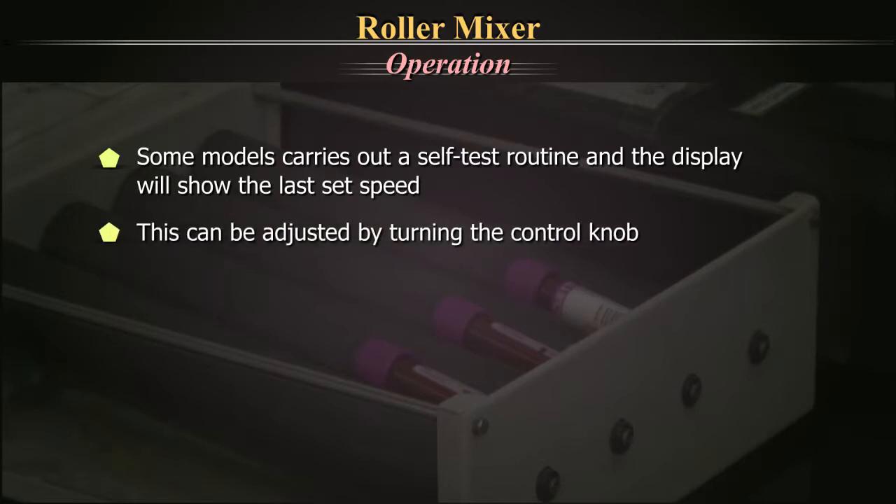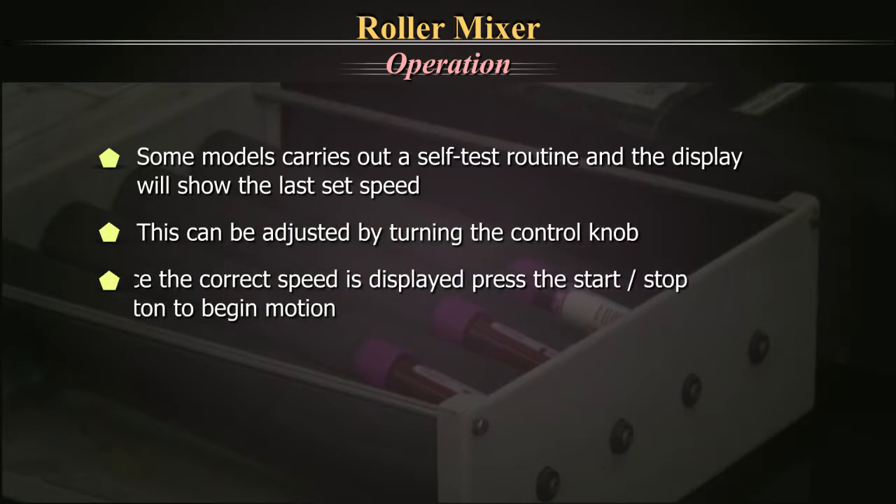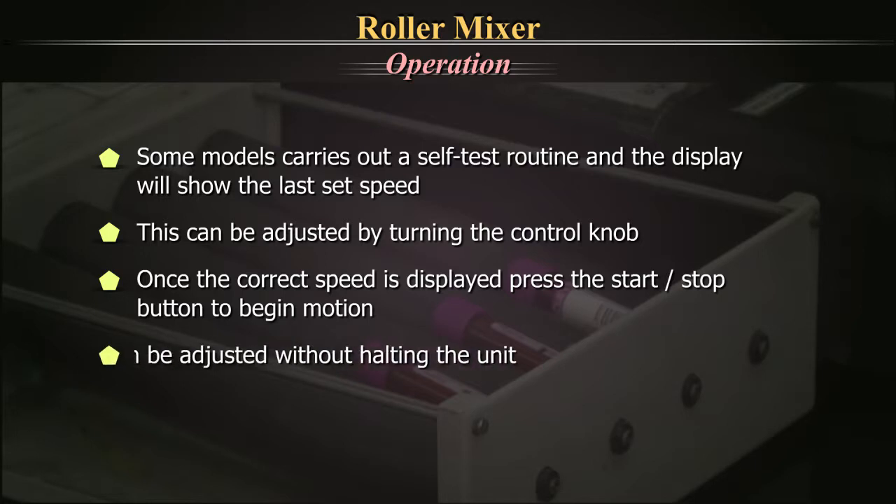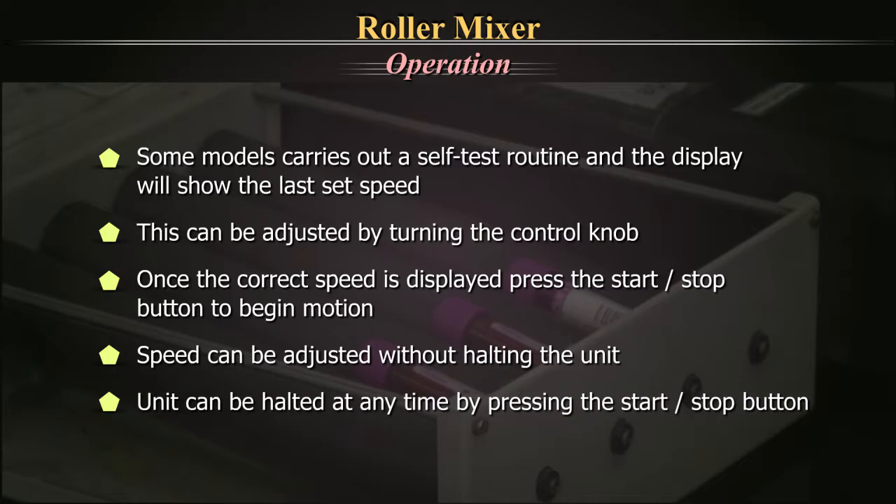This can be adjusted by turning the control knob. Once the correct speed is displayed, press the start button to begin motion. The speed can be adjusted without halting the unit. The unit can be halted at any time by pressing the start/stop button.